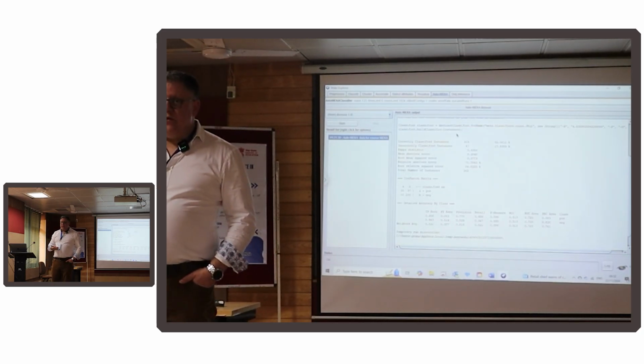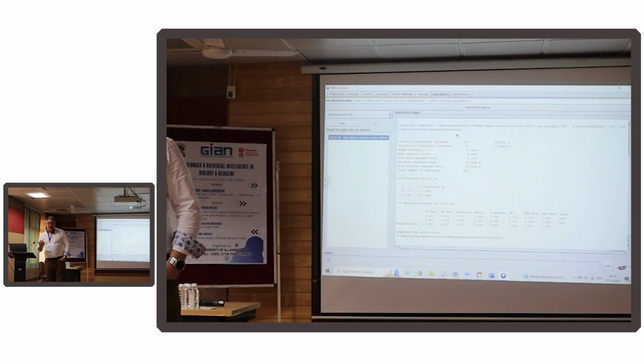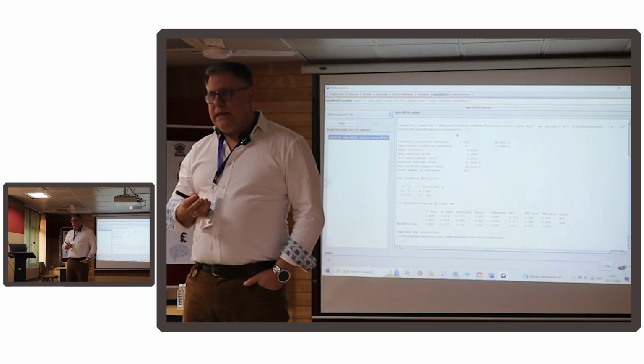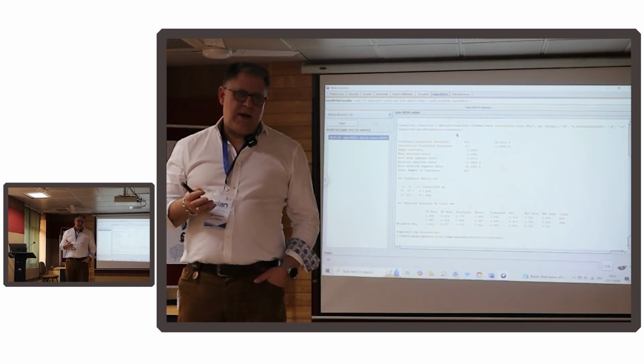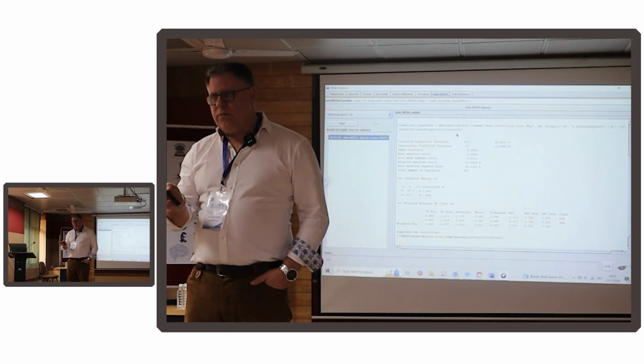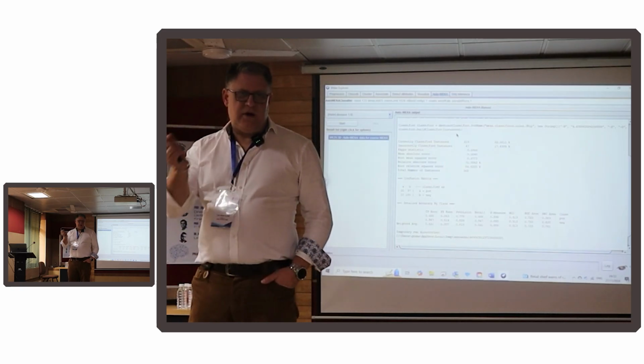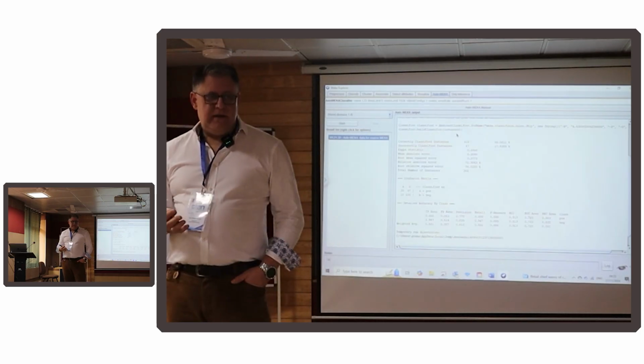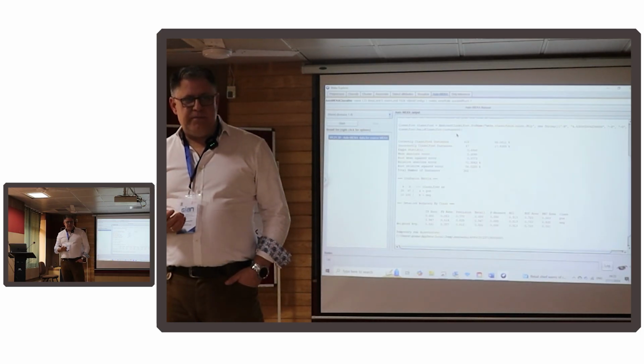So when I build a classifier, I have to balance the numbers, ideally. I can probably get away with 2 times versus 1 time, say 2 times A, 1 times B. But much more than that, I start to introduce bias.